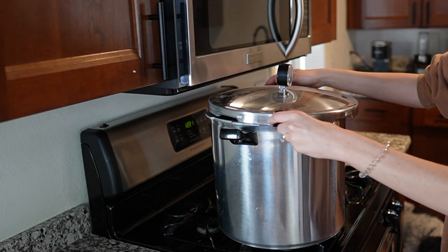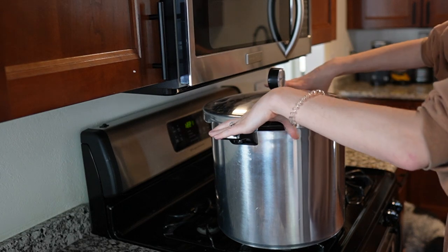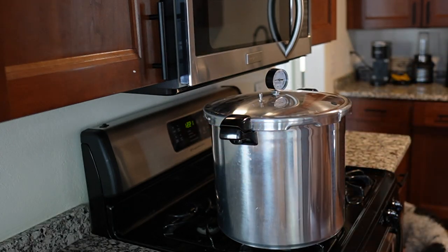Next, secure the lid onto the pressure cooker and move it over to the stove if it's not already there. I have a gas range and have never used a pressure cooker on an electric stovetop — if you have an electric stove, I'd recommend watching tutorials on pressure canning on an electric stovetop, as the process may differ slightly. Alternatively, if you have an Instant Pot, you can also use that to autoclave tissue culture media.